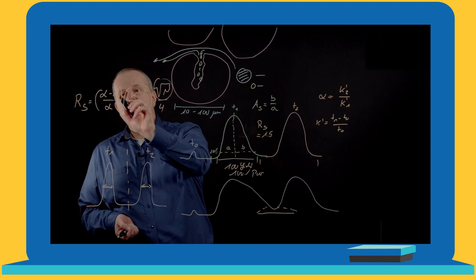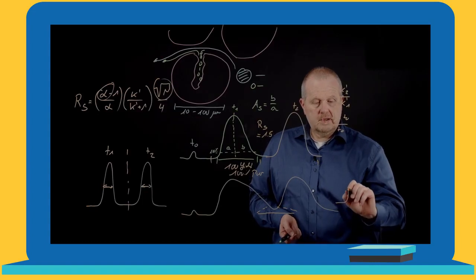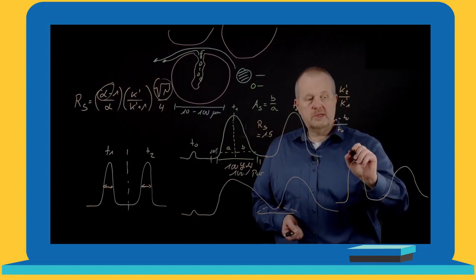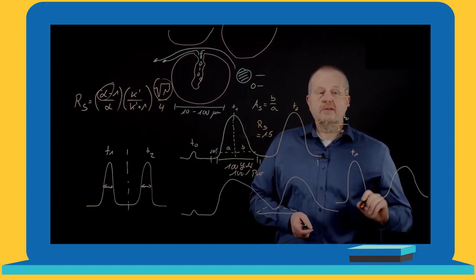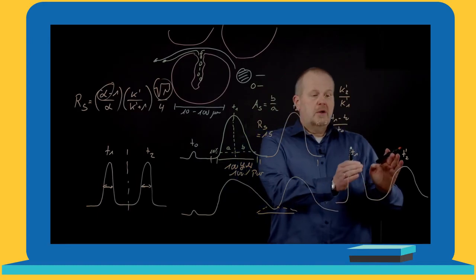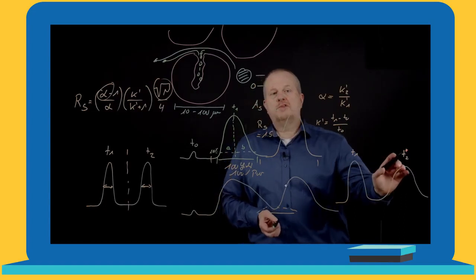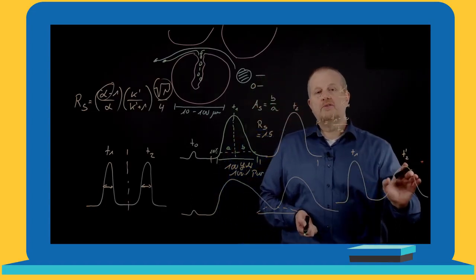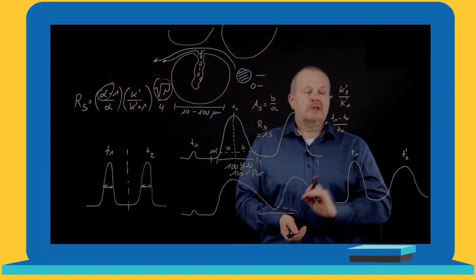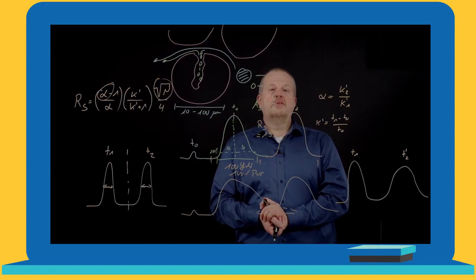What is without limitation is to increase selectivity. When we increase selectivity, the peak width stays the same, so not very efficient peaks. Let's say T1 stays the same, but T2 is now longer because we have increased the selectivity. Increasing the selectivity in this case means the attraction forces for our second compound of interest is higher than it was in the original chromatogram. So increasing the selectivity is the best way to optimize our preparative separation.